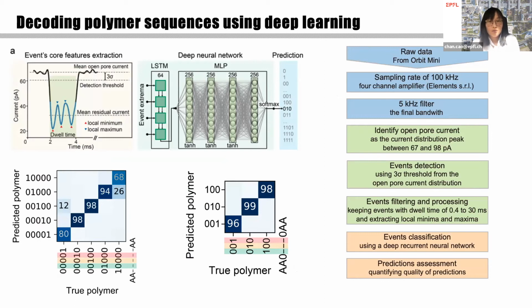This result shows us that the detection of bit 1 is difficult when it is directly adjacent to the terminal nuclear base. If we only use the innermost positions, then the accuracy can be as high as 97%. So we only use the inner position for the following reading of a single bit.